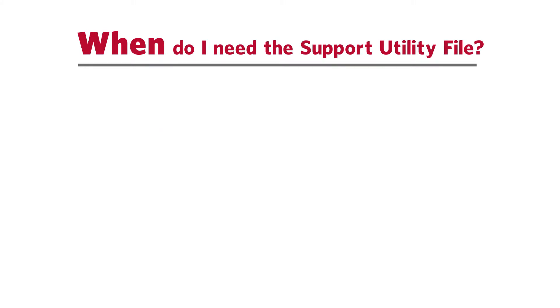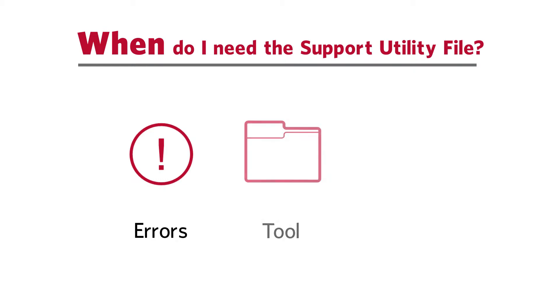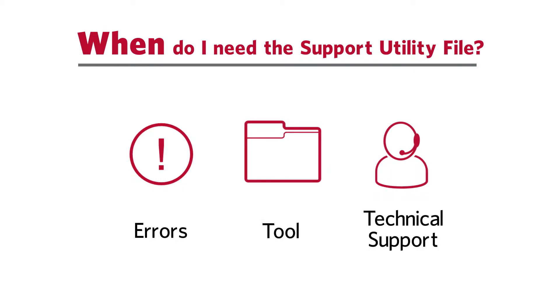If your Luminex instrument is reporting errors, Luminex Technical Support may ask for the support utility file in order to review the failures, troubleshoot the errors, and get your Luminex XMAP instrument up and running again.